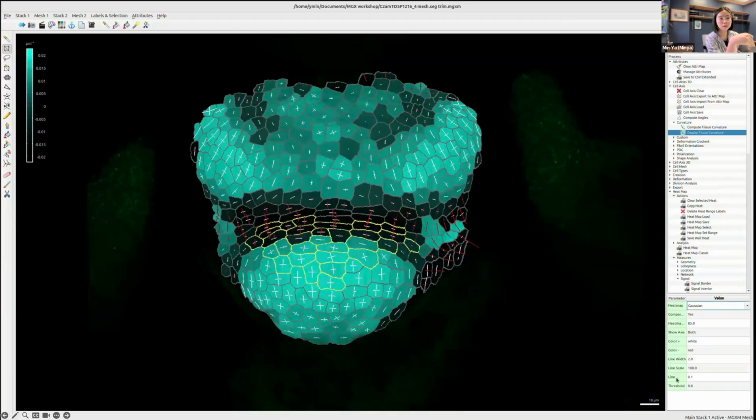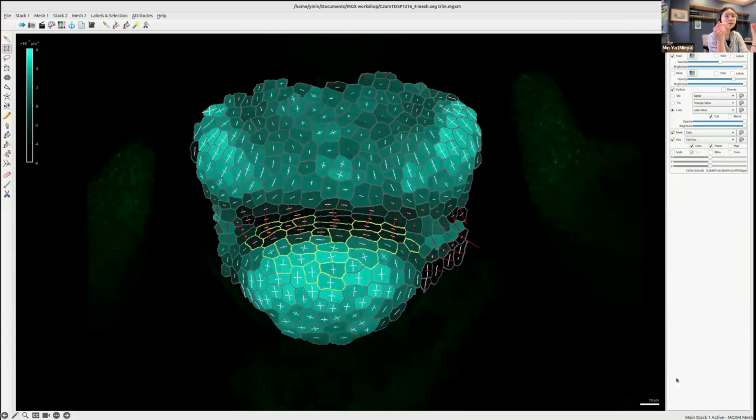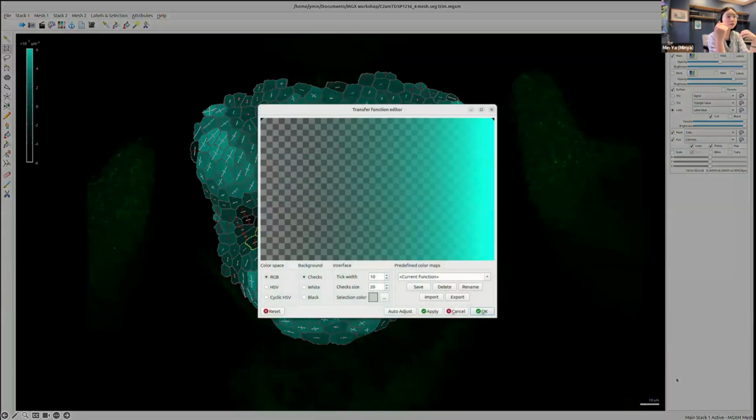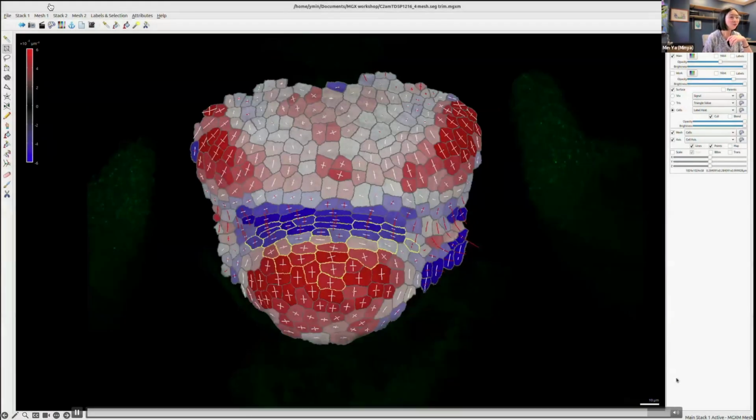And there are different types of curvature, and I have been using Gaussian surface curvature consistently. And for all the curvature maps in the study, they have the same heat map scale as well. So now I'm setting that scale, and then finally we change the appearance of the heat map. And done.